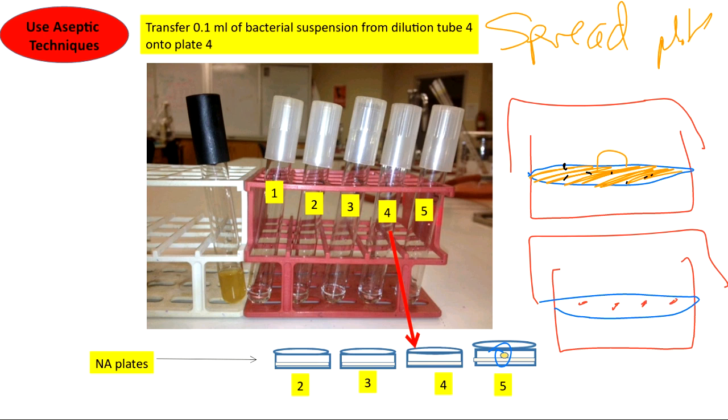The advantage of the spread plate method is you're not using heat. The agar is already made, no heat used, so you don't have to worry about heat sensitivity on the part of the bacteria. Another advantage is you could actually pick up the cells because they're all on the top and create a pure culture if you wanted to. In the pour plate, if the colony was embedded inside the agar, there was no way to pick it up. So be able to distinguish pour and spread plates.